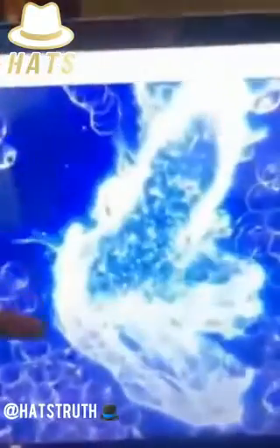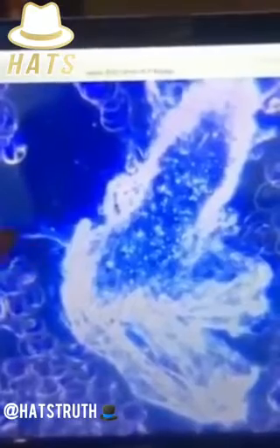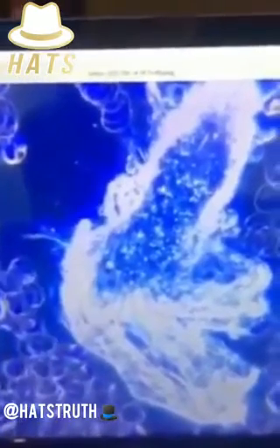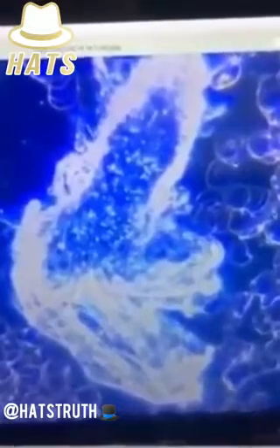So let's look at the next one and try to get through this. What are we looking at here? Here again, the blood cells are coagulated, and again there is something in the blood. Here again are these things on the side. So very similar. I can only think that must be graphene oxide. Must be graphene. Well, Dr. Young has unequivocally proved that it was graphene. It is graphene in the blood. But we've only got microscopy to work with right now.